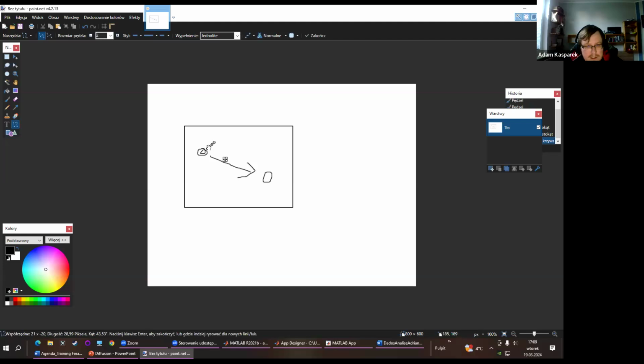We go here, then here, then here. And then we check where it was lower than our initial point. Okay, here was the lowest point. So we go further, from here we check one area, a second area, a third area. The program checks every area around to decide where it should go to do the fitting.